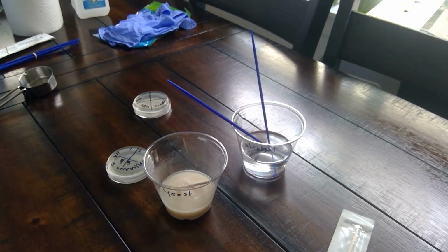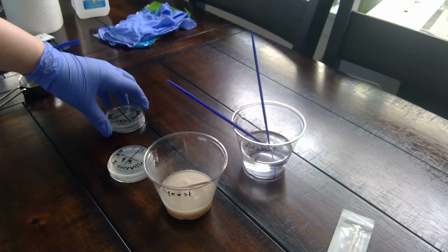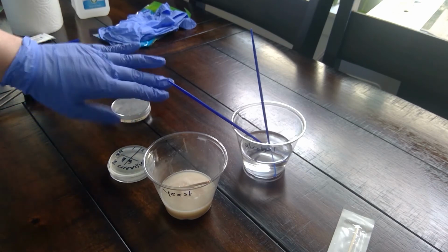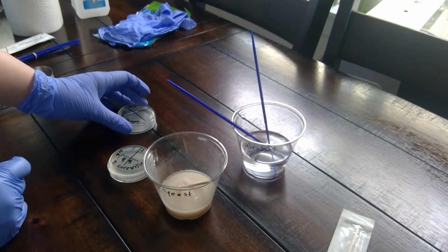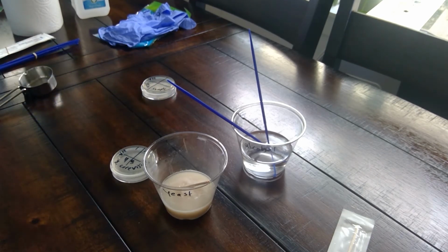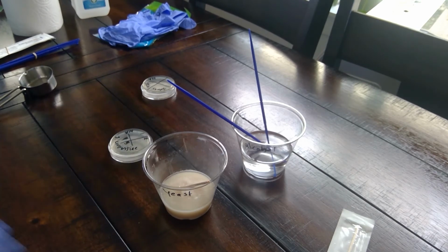So now we're at step 13, return the lid to the agar plate. You don't want to work with it like this and lift up the plate, because then things can fall onto your plate. If you work under it, it doesn't expose the plate to things that are in the air, and you can be sure that you're not contaminating your plate.